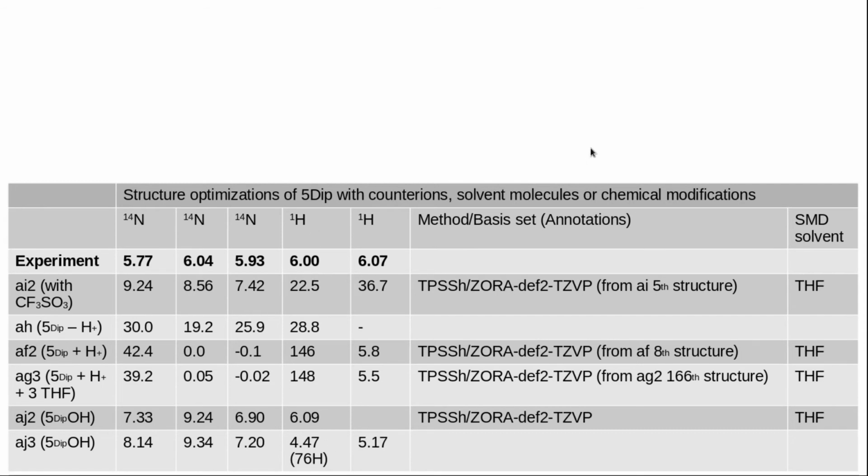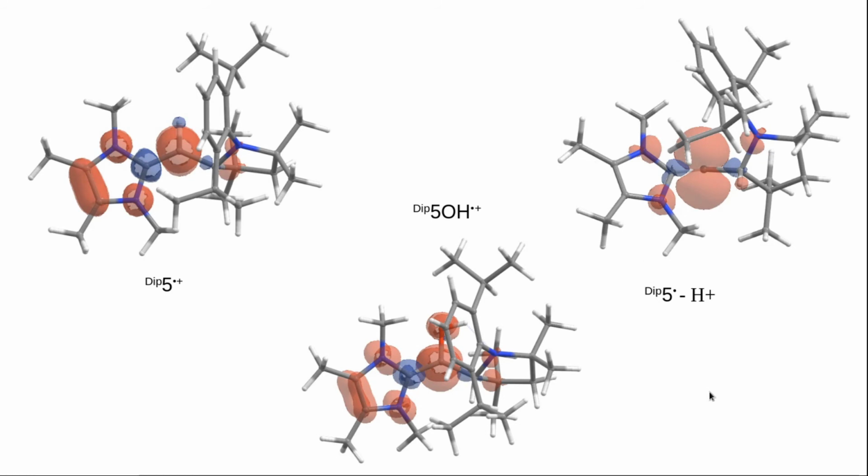So this is basically to show that in some cases you have to calculate things carefully and not trust just an intuition or a simple superficial analysis of the spin density, and that in some cases you can use a calculation to really see that something in the experiment doesn't match, and you can actually propose another molecule or another variation.